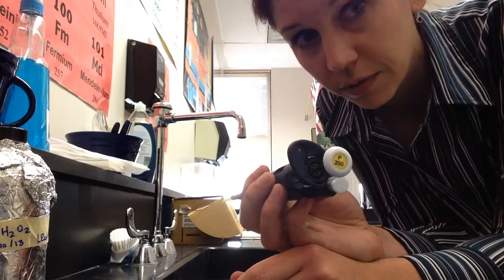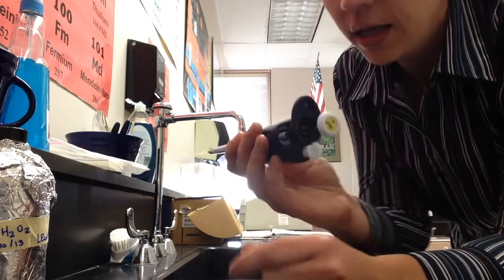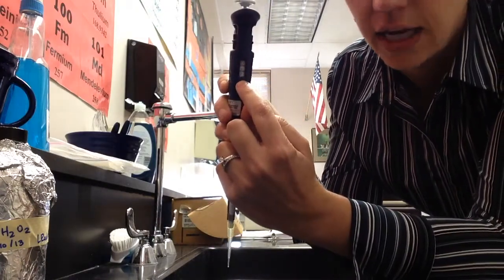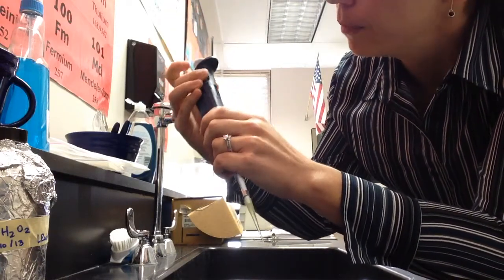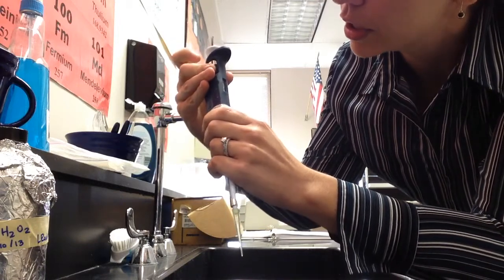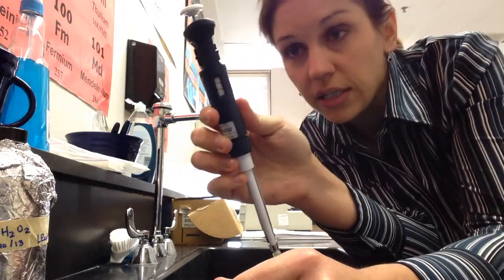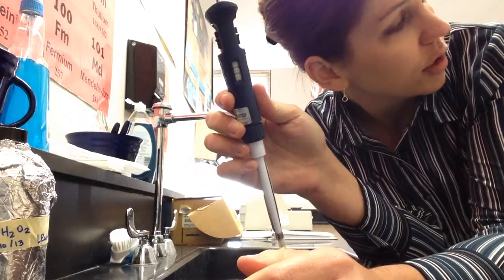But for now, I just want to give you a quick tutorial about how these work to make sure that you get the right quantities of the liquids that you need. I will have preset them to a quantity of 100 microliters, and you'll be able to see that on this dial on the side. You twist these black knobs until you get the right number, and this is just telling you how many microliters you're going to get per dose. In this case, I've set it to 100 microliters, and so for one of your liquids, you're going to need 200 microliters, so that's going to be 2 doses, and for the other one, it's 300 microliters, so that's going to be 3 doses.